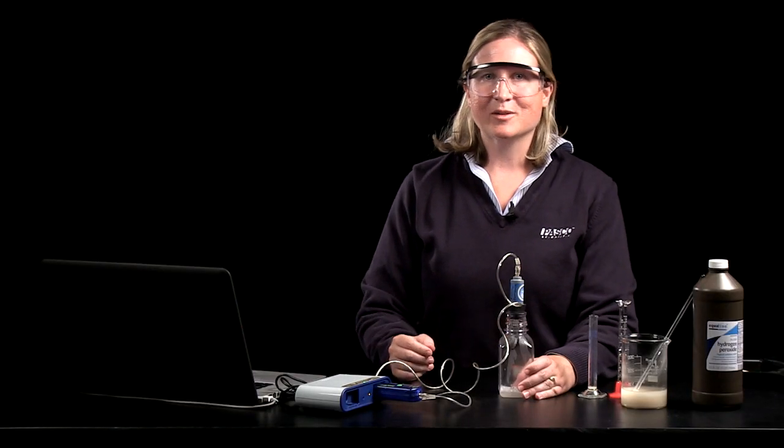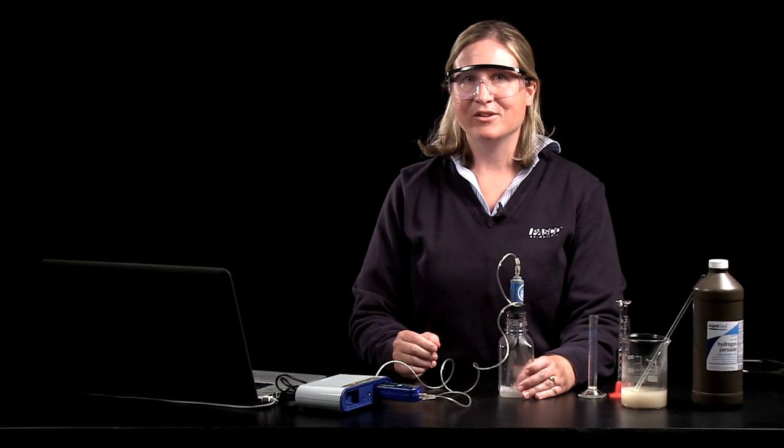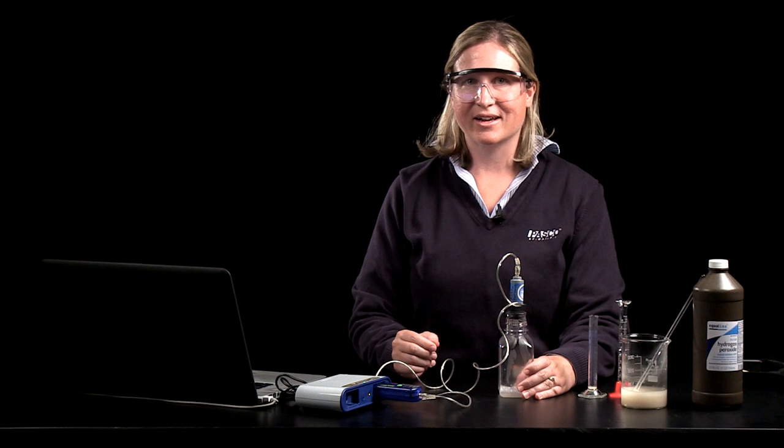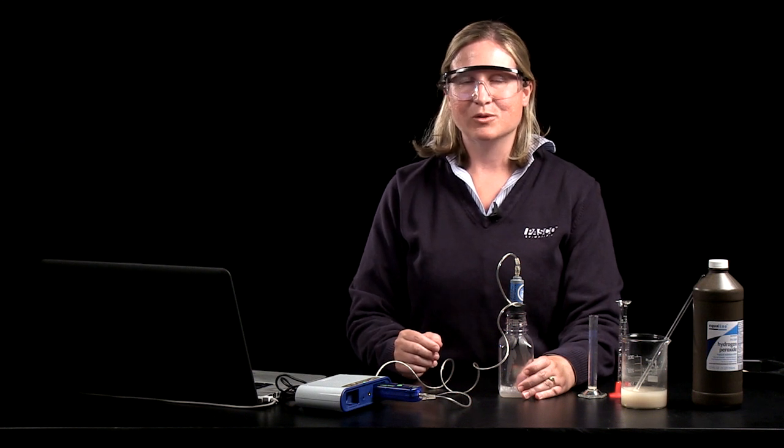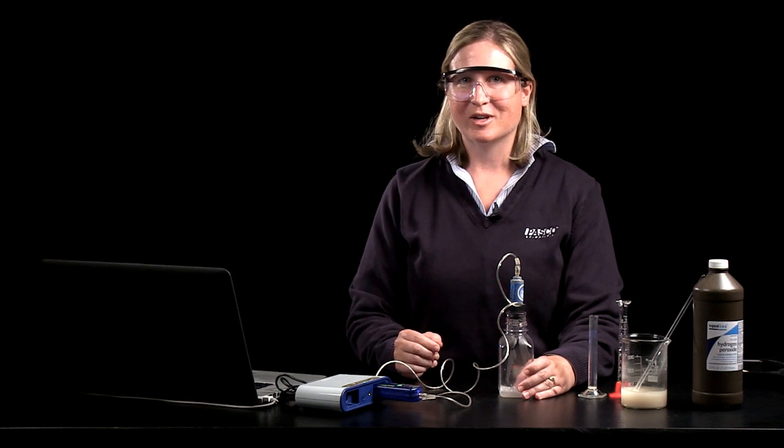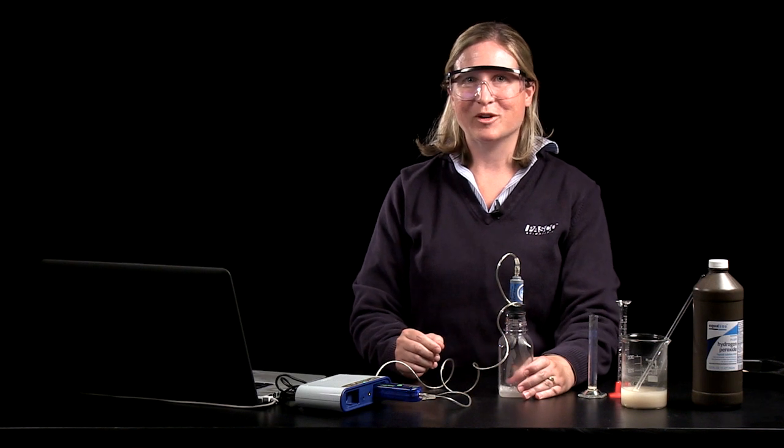So I hope you have some ideas now for your classroom and using the oxygen and carbon dioxide gas sensors to help teach your students those concepts throughout the year. Thank you for joining me today.